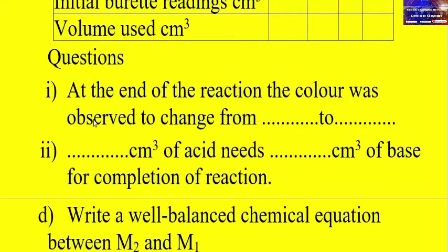Question number 1: at the end of the reaction, what is the color change observed from the start up to the end point? Remember that we have the POP indicator.